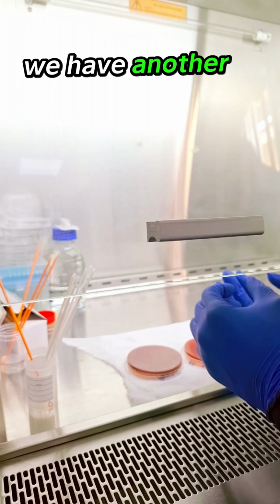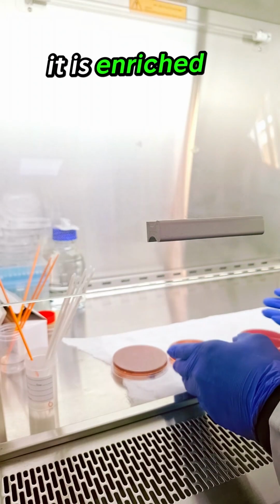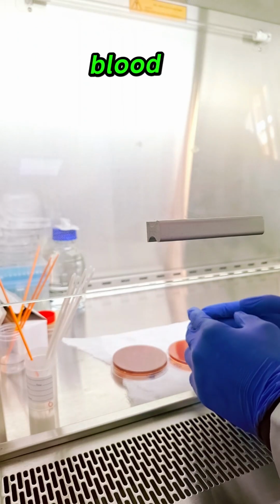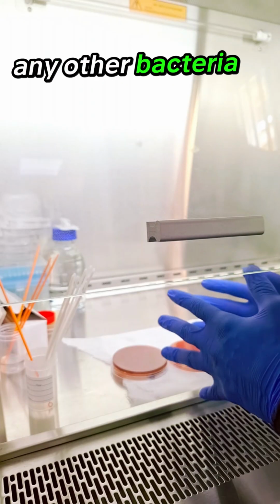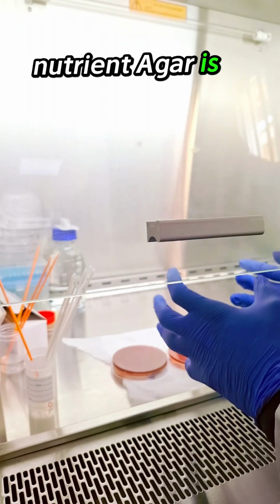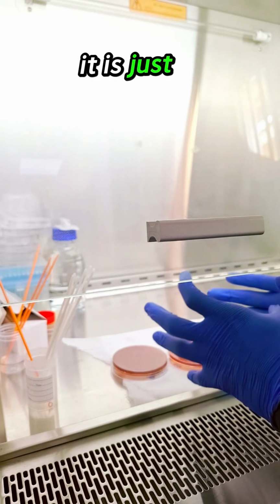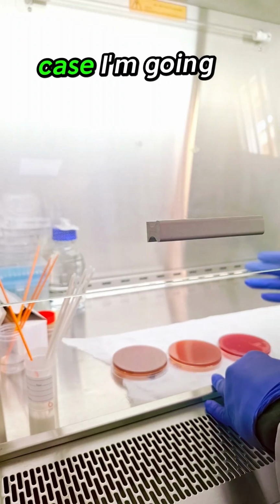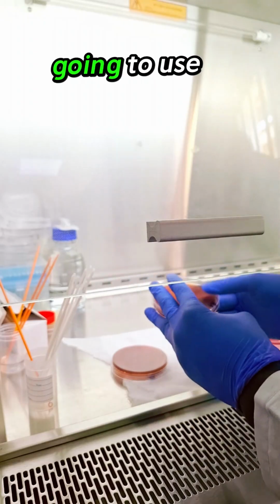We have another media, the blood agar, which is an enrichment media. It is enriched with sheep blood, and because the blood has nutrients, it can support the growth of any other bacteria on that plate. We can also use nutrient agar, which is just a general basic media that can grow any type of bacteria. I have MacConkey here and also blood agar, but in my case, I'm going to use this blood agar.